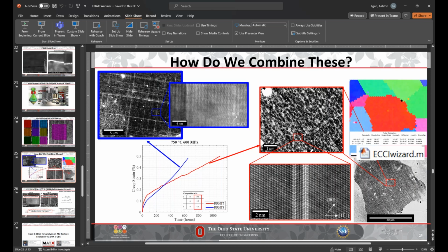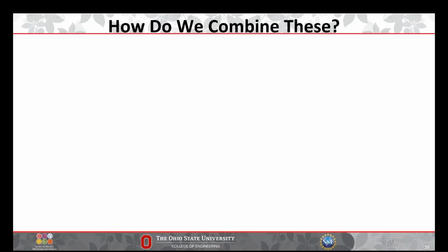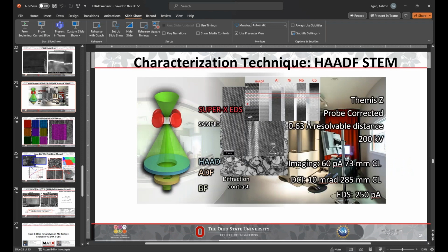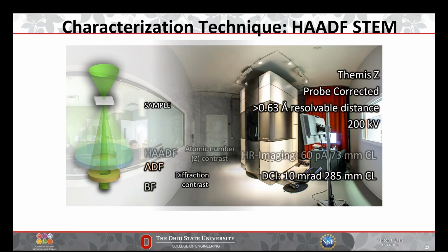Okay, just a few more questions. How important is it to have the accurate lift-out foil orientation for the atomic resolution TEM EDS analysis? And is it practically feasible during TEM observation? Yeah, so here, this is a good slide to show, I guess, why it's important.